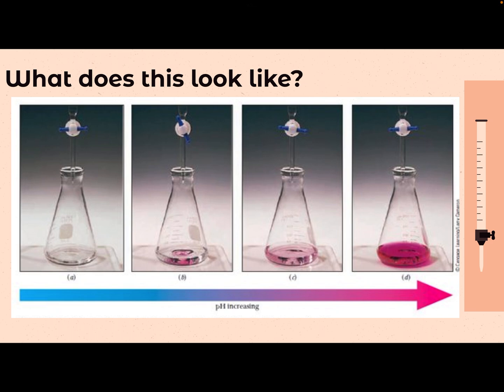This is a picture of it because I wanted to show you this last picture here. Basically, how far is too far? If you start adding in your titrant and you're going farther and farther into your titration and you reach that faint light pink color and you think, maybe I could use a little bit more, and you add in too much, you're going to over titrate.